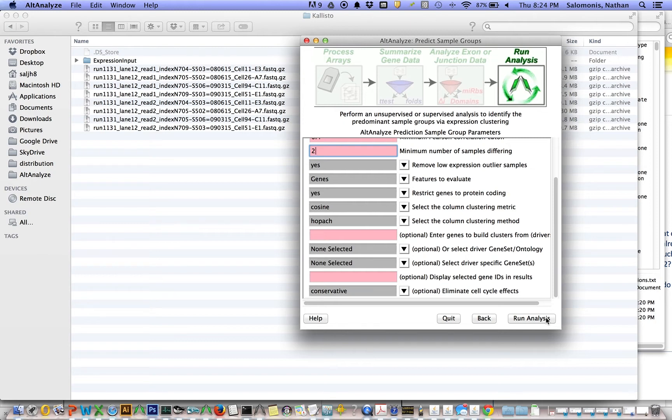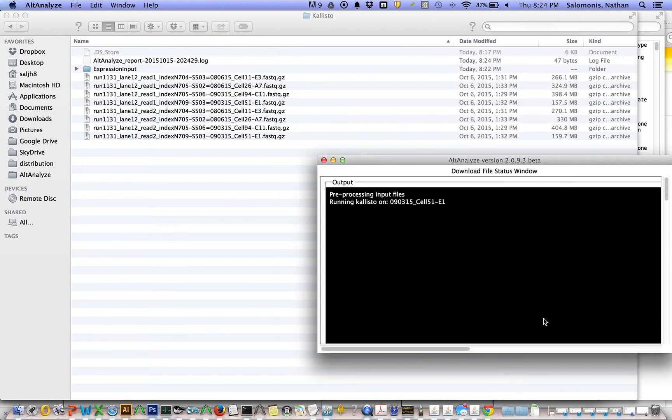This is going to perform an unsupervised analysis, but first, if I hit run analysis, it's going to run Kallisto.